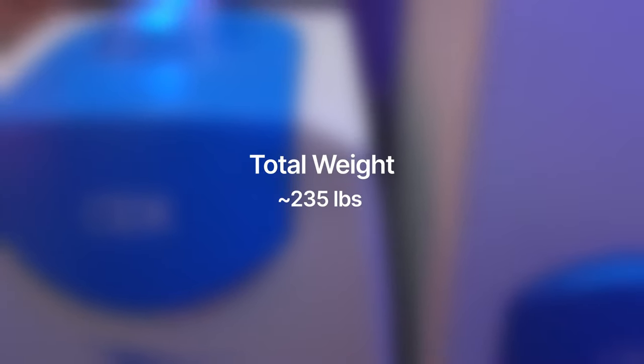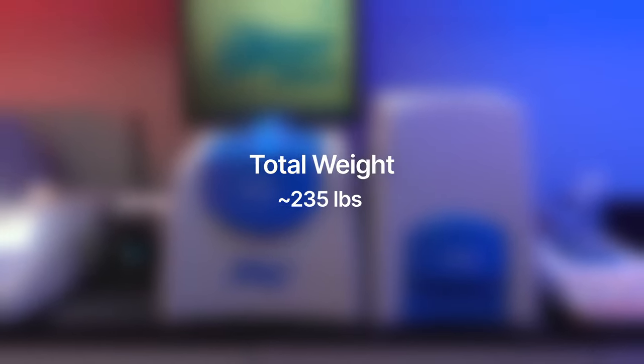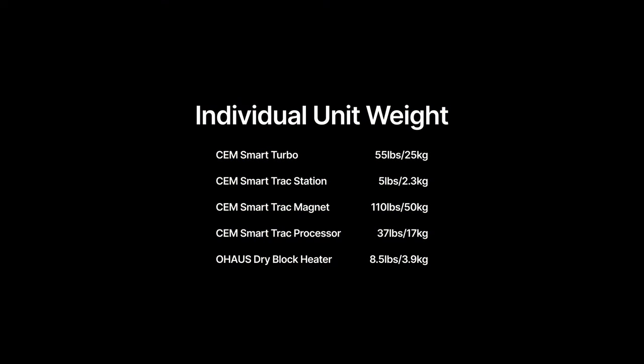Altogether, the combined weight of all the instruments will be around 235 pounds. The individual weight of all components is on the screen now.